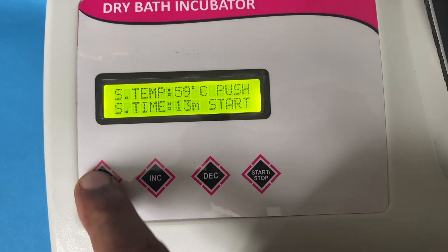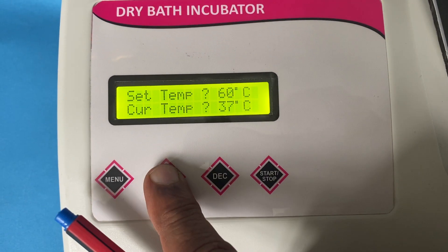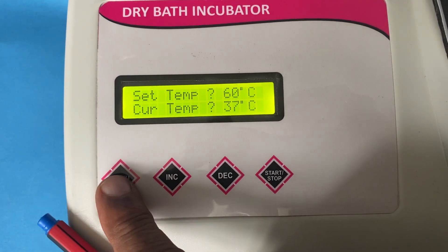If I just push it, it says 59 degrees. I can increase it to 60 degrees, decrease it, and I can set it.